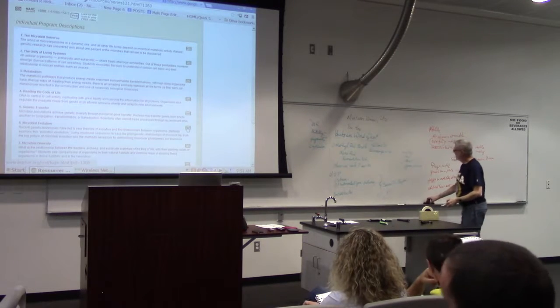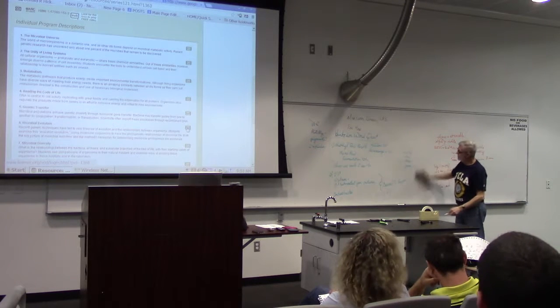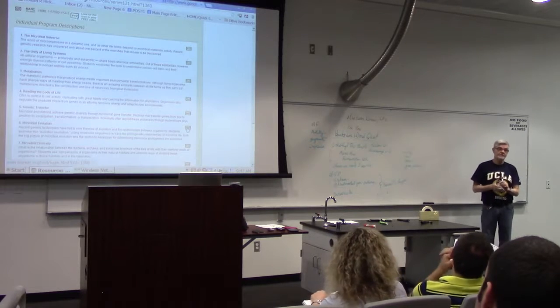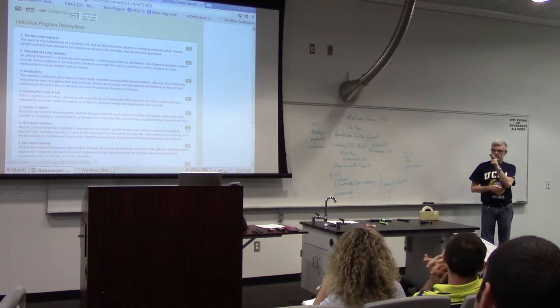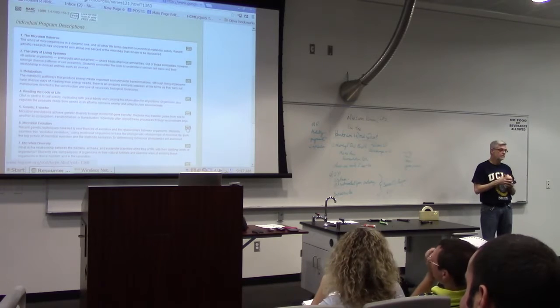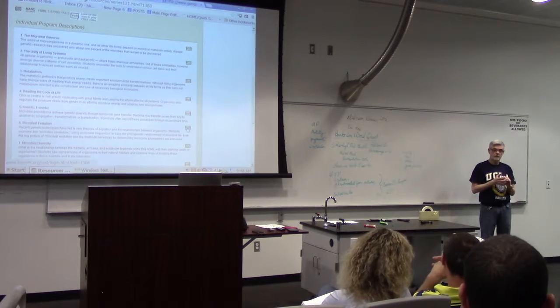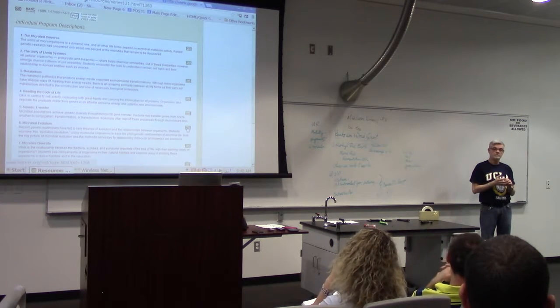Pigment. A lot of you have not read pigment, and sometimes they revert in the middle of the 7 days. So if you did it on Monday and came in on Saturday to read it for the very first time, it might have gone to yellow and back to pink. Somebody in here did. Yes, hers reverted. So if you don't read it every other day, it can give you a misleading result. For a test like MRVP, yesterday we did it, today we have to read it and determine whether it's positive or negative. If you waited till Monday, it would still be read as positive; it wouldn't revert.